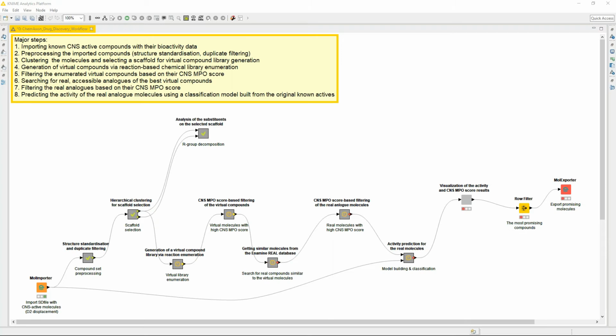Okay, so I already tried earlier. Yeah, probably you're trying to import the workflow again. But in the KNIME Explorer, I have local workspace where I have ChemAxon KNIME and drug discovery workflow also. Under that I have data and results.